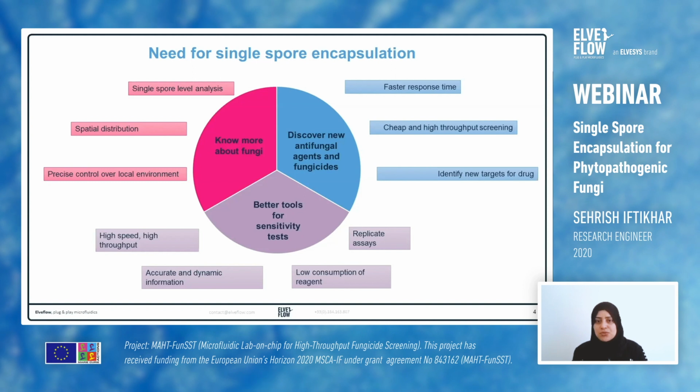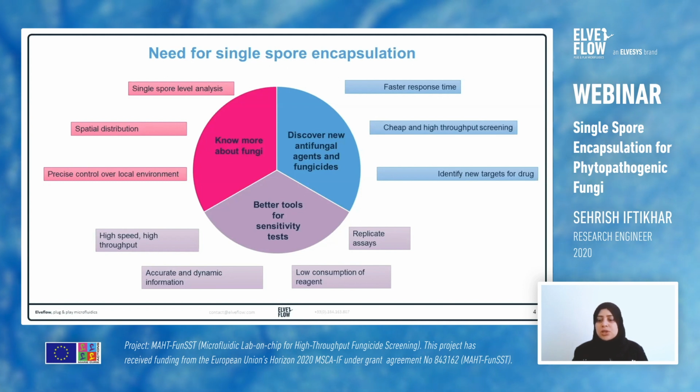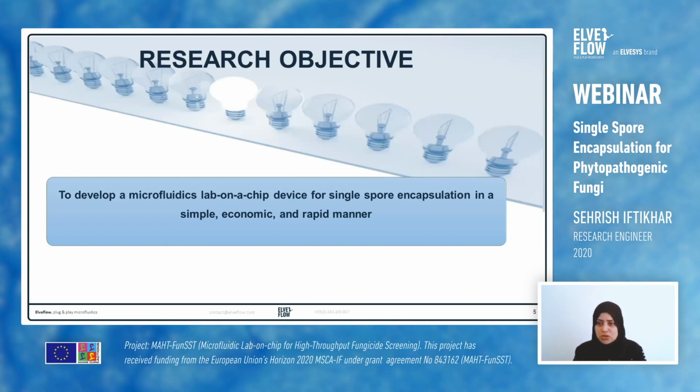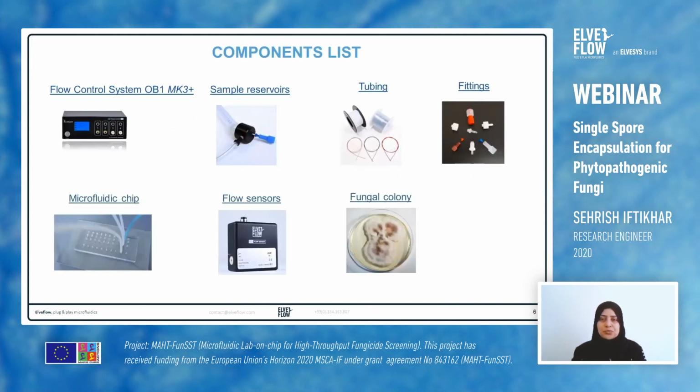And also, as we are studying the single spore, it can provide some new drug targets like some enzymes which we can target to design new fungicides. So our objective is very straightforward, which is to develop the microfluidics lab on chip device for single spore encapsulation in a very simple, economic, and rapid manner.